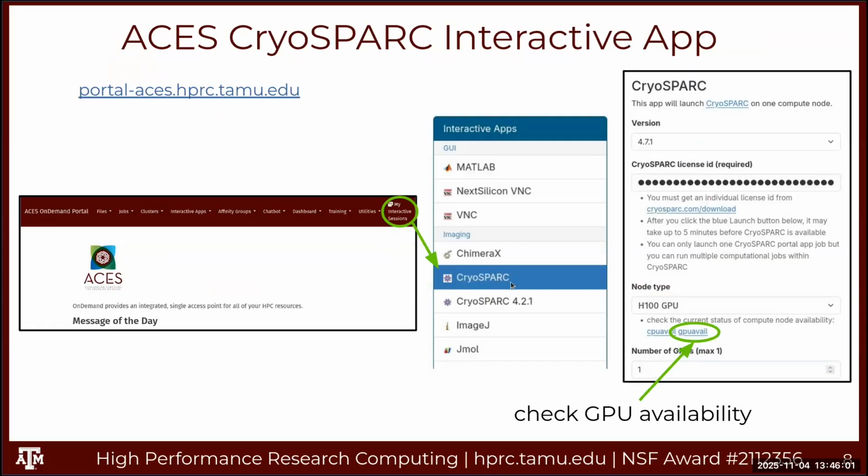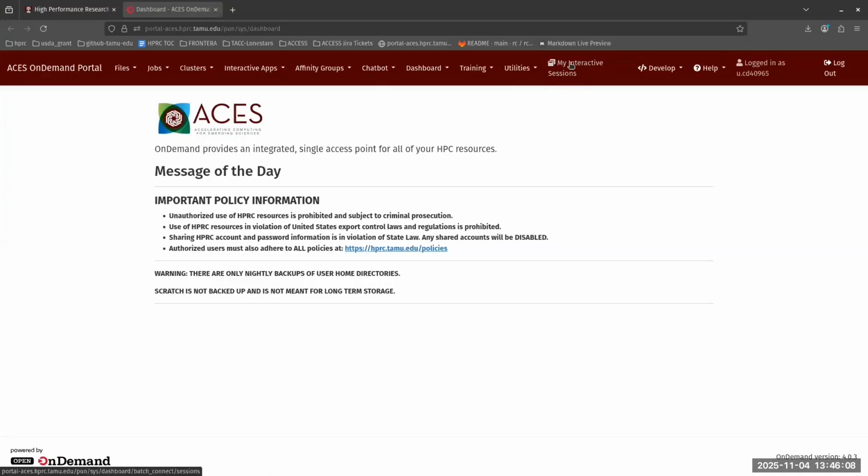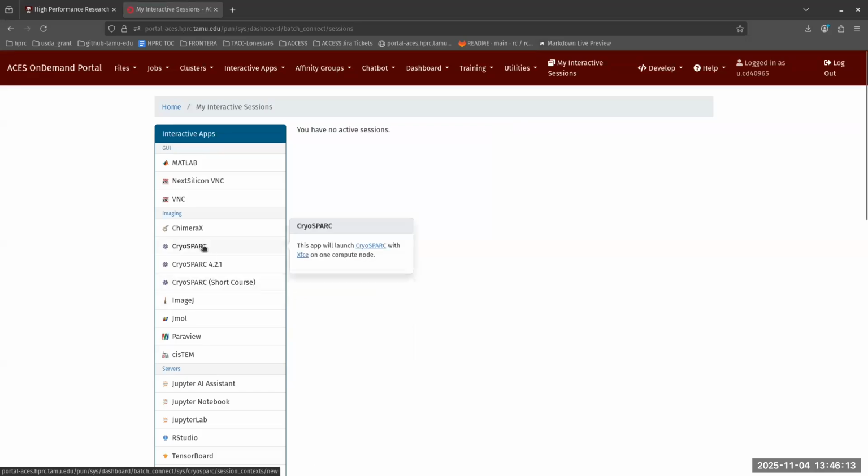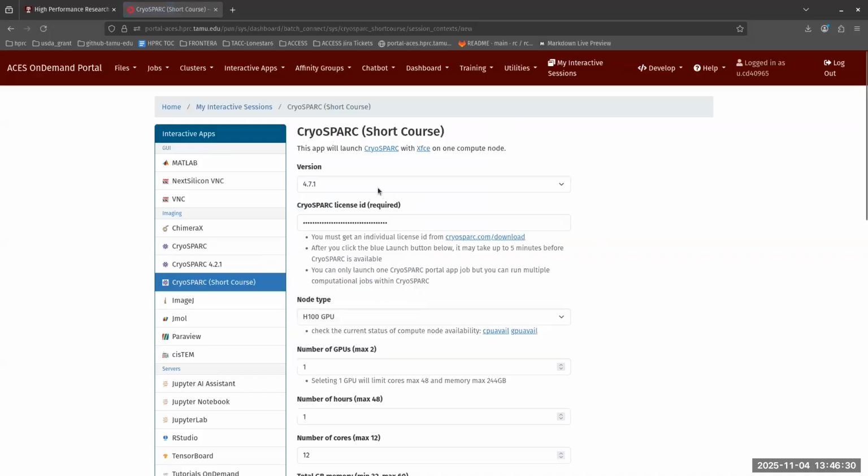All right, so now we're going to select My Interactive Sessions, and we're going to select this CryoSPARC short course. The CryoSPARC short course is only going to be available for today. If you're watching this on YouTube, you'll select the newest CryoSPARC. 421 is the older CryoSPARC. It may not work for new users, so if you're new and you're not in the short course, use this CryoSPARC 471. But for today, we're going to use CryoSPARC short course.